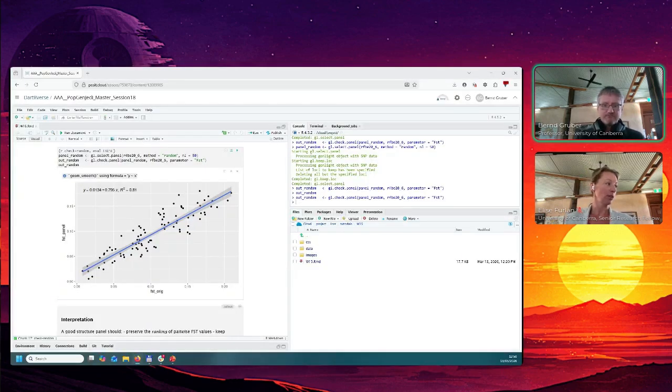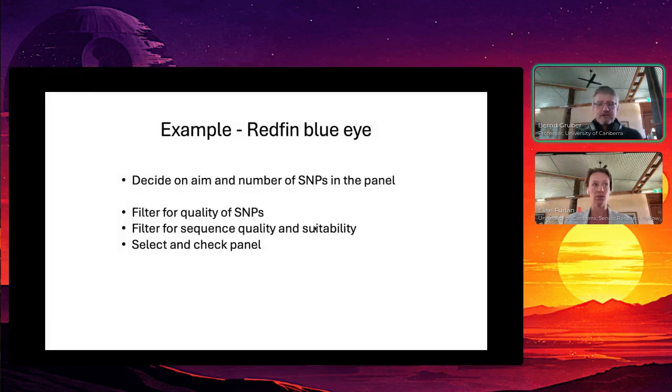So we did that, in a simulation where you try to identify what is a good panel for this data set, run a simulation and explore the parameter space, and came up actually with quite a nice one, which fits 4 of the 5 kind of things. We could never get Ne estimates which are good, but we could get other estimates quite nicely. Frozen on me, sorry. Okay. Maybe it wasn't a good idea.